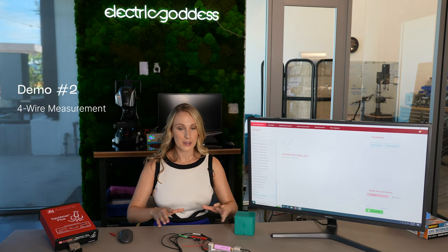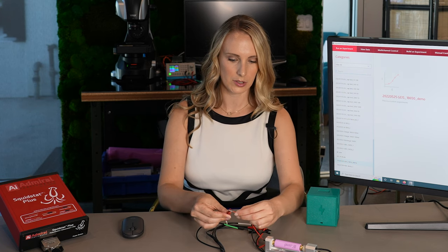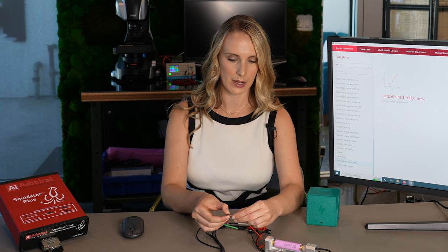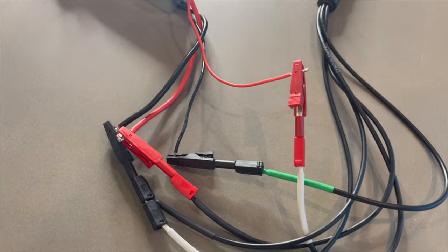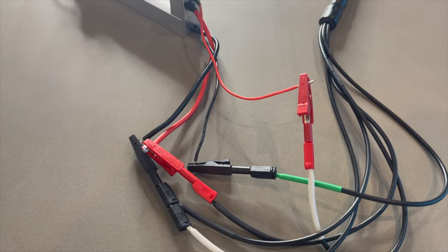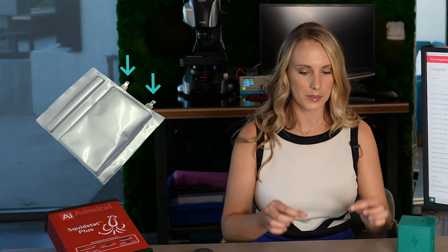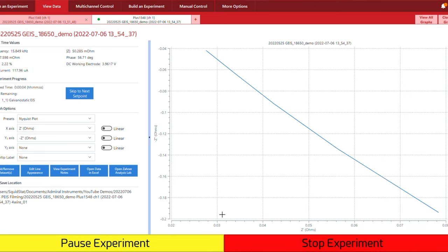Now we want to rewire this configuration for a four wire measurement. The only thing we want to do is just disconnect that sense electrode and connect it to that extra red lead there. When your battery is wired in a four electrode measurement, it should look something like this — you have the four leads connected to the four wires. In the case where your battery just has tabs, you want these four alligator clips or leads connected onto the tab — that's right, two alligator clips per tab. Now we can run this experiment, and here we've started it, collecting that impedance data on the Nyquist plot for the four wire measurement.